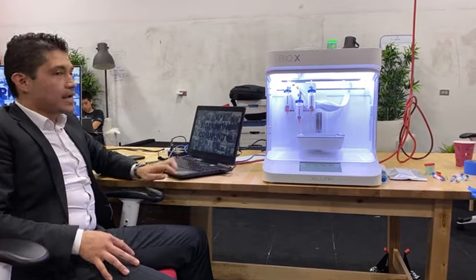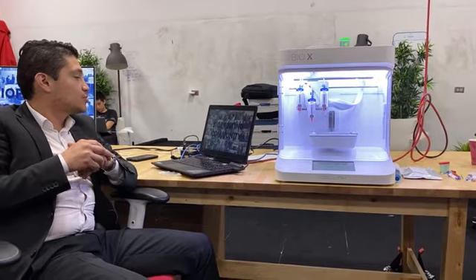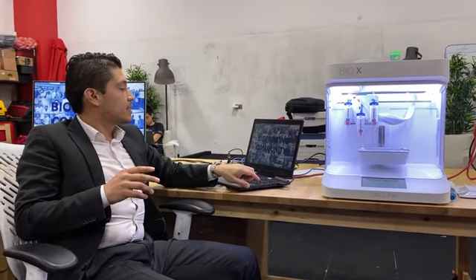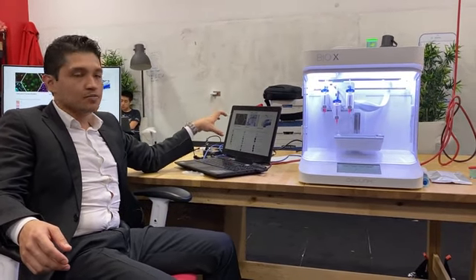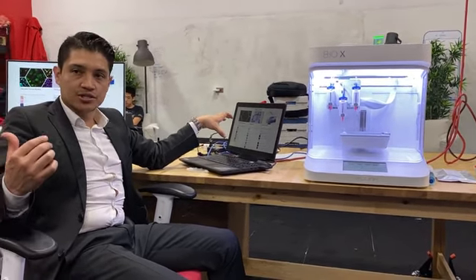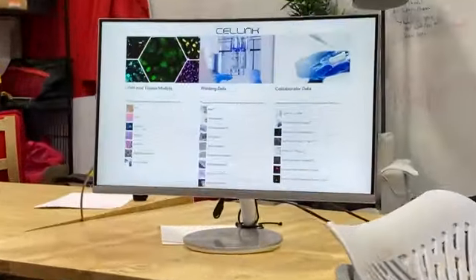And if you want to know something more about this kind of technology, you can go through the bioprinting community and download the cell and tissue models that are there on the page. The Cellink page is here, right?